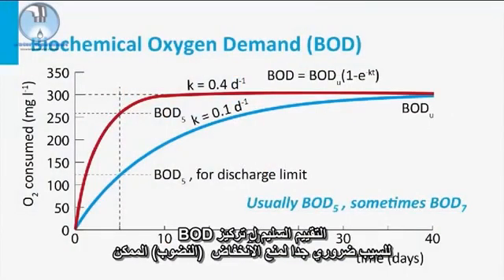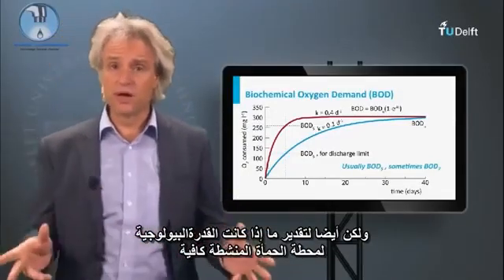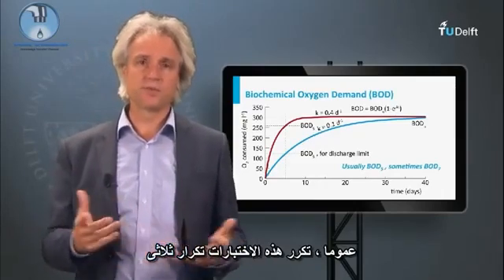Proper assessment of the effluent BOD concentration is absolutely necessary to prevent possible oxygen depletion in the receiving surface water, but also for estimating whether the biological capacity of an activated sludge plant is sufficient. Generally, these tests are done in triplicate.